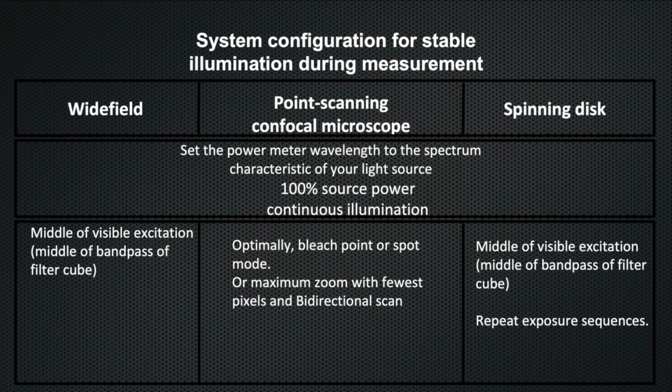For example, thermal fluctuations in the room, laser alignment micro variations, vibrations, etc. It requires a power meter with a data logger, as you need to perform one measurement every 30 seconds for 2 hours. For short and mid-term monitoring, you ideally have to do it every year or every time you notice something strange with your laser stability or the environmental conditions.